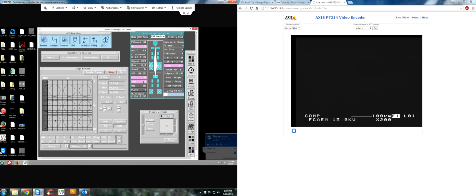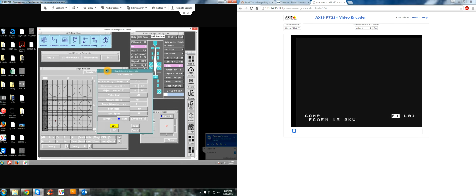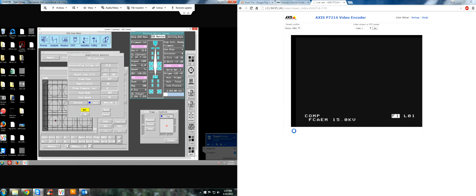So the first thing you want to do is let's close the Faraday cup, PCD in, turn the scan generator off. On the quantitative analysis, under measurement, hit EOS condition. Okay, and what you want to do always is adjust the current so that it's at 20 nanoamps. You do that by clicking on the EOS monitor, clicking on current, and then adjusting it.